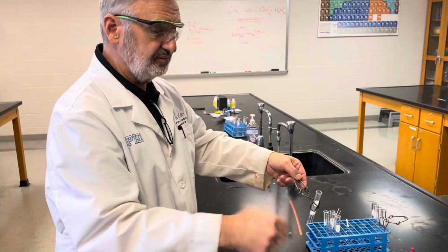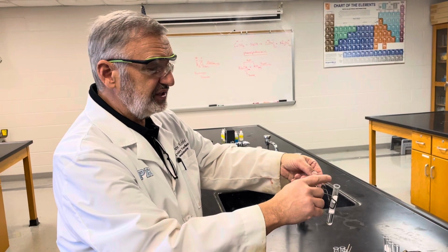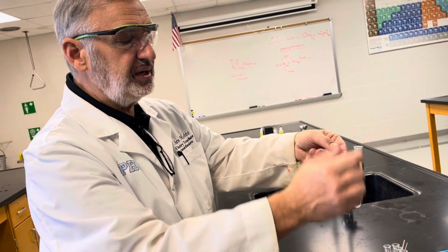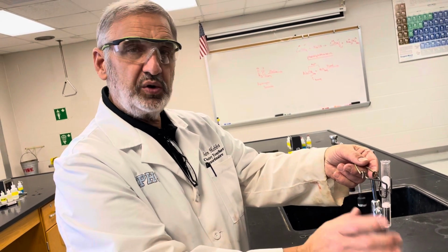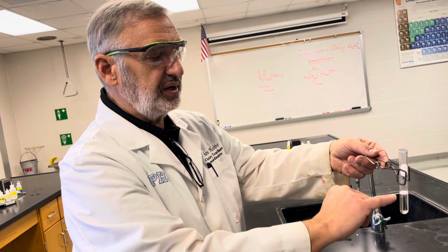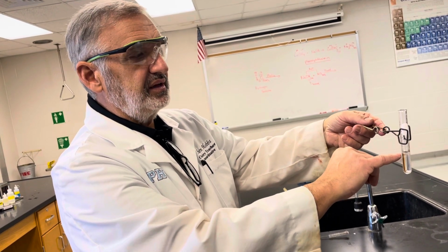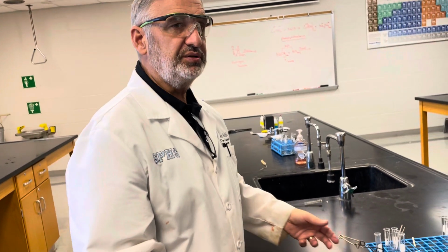So you can see that it's indeed bubbling, and there's a gas being given off, and the gas that's being given off is flammable. And then when I feel the bottom of this test tube down here, I only hit the flame up here. When I feel the bottom right where the reaction is, it's very hot. So you need to record that in your observations, that it's very, very hot as the reaction is taking place. Also note that the magnesium has completely disappeared from the solution. So that was reaction 2.